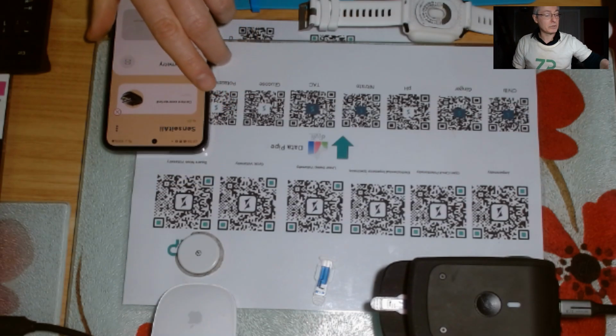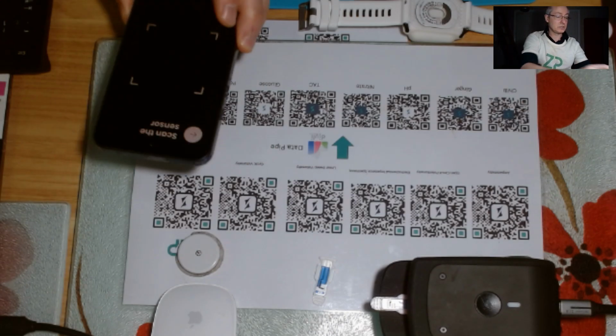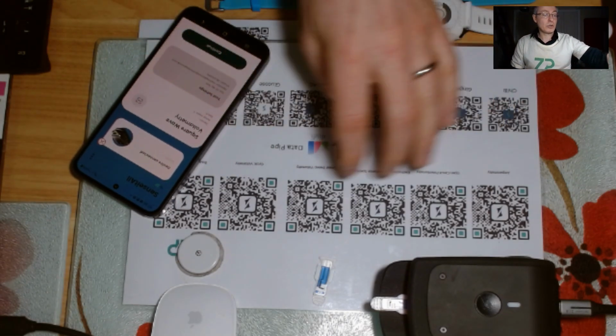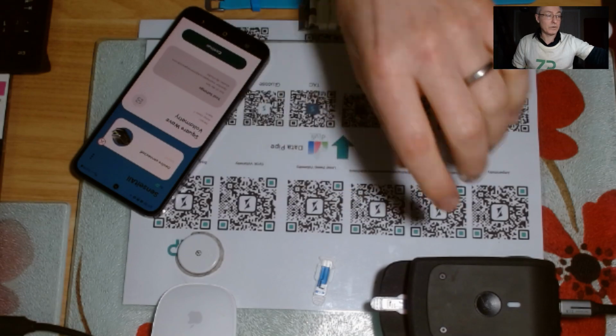So if you're doing enzymes, amperometry is a good technique. I also think square wave voltammetry is a good technique as well. So I'll just scan that one for a second as well. So I'm able to go between these different techniques using a QR code. And then what's nice is I'm in Bluetooth connection with this device.